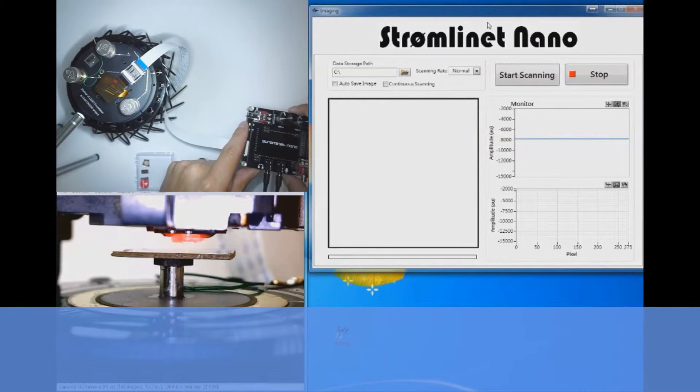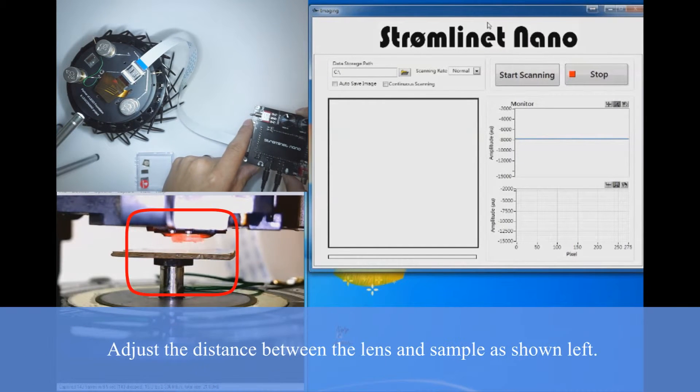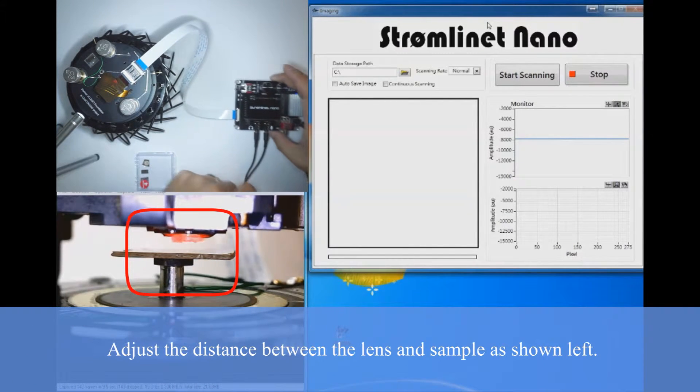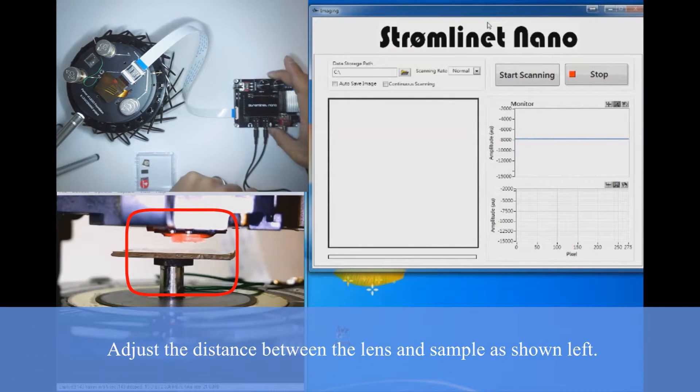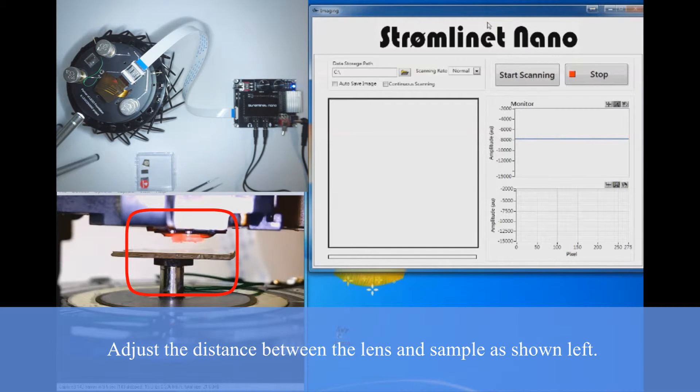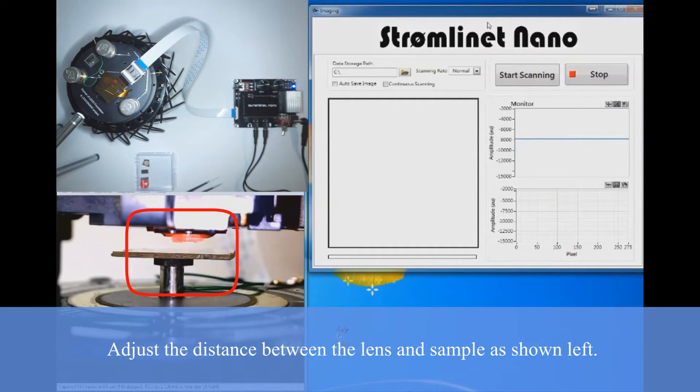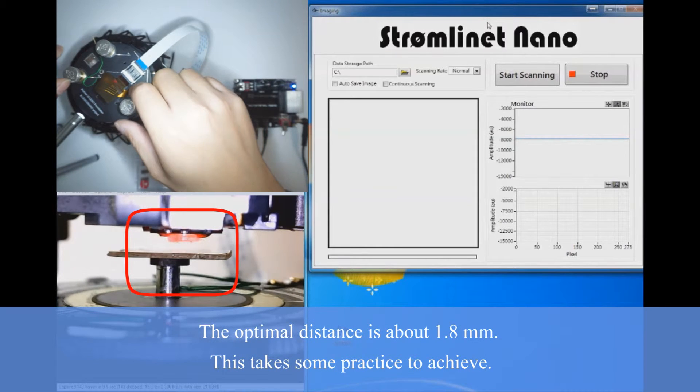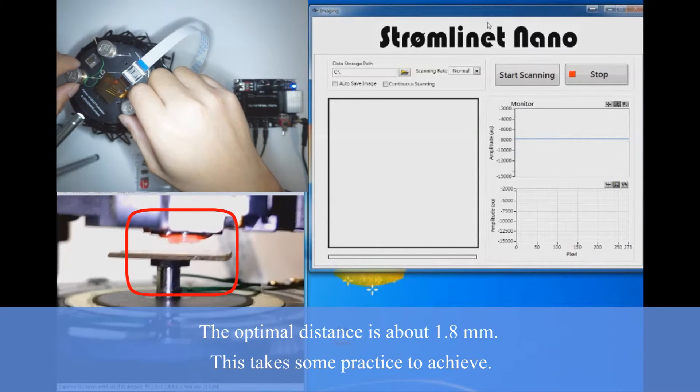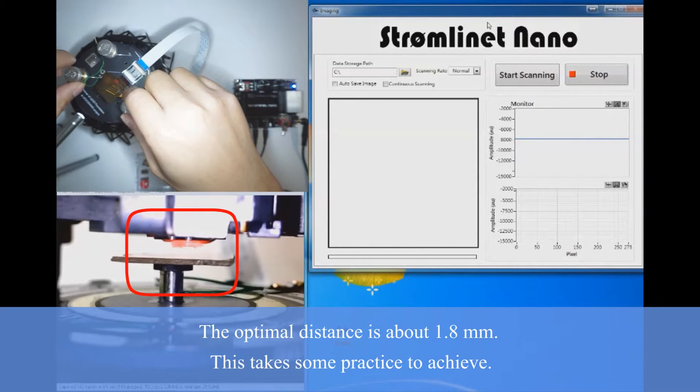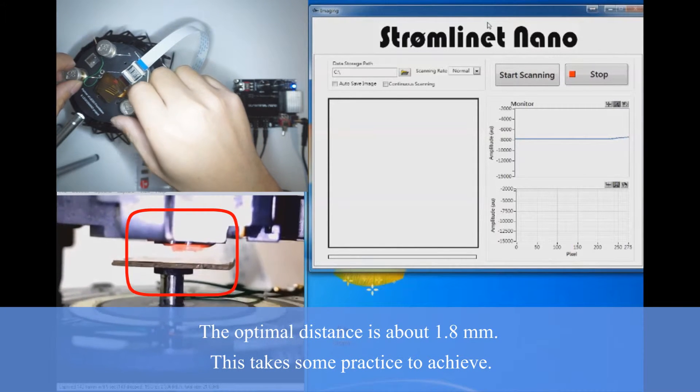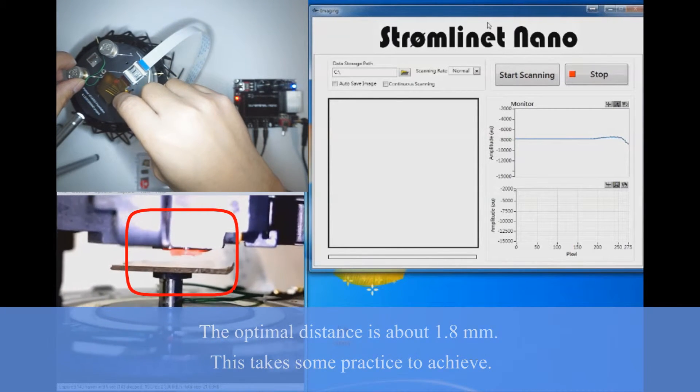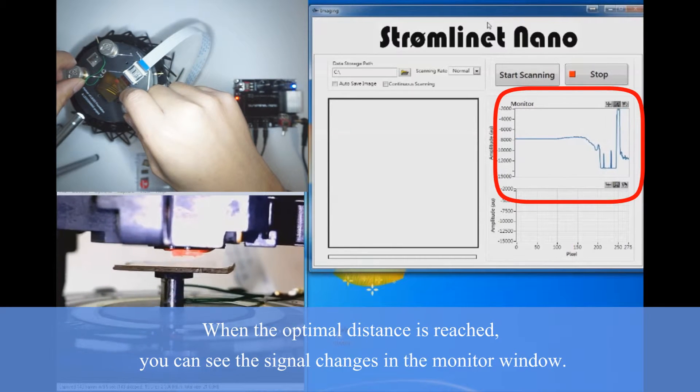Now let's adjust the distance between the lens and sample. Let's approach by turning counter-clockwise. The optimal focus distance is about 1.8 millimeters. It'll take some practice to achieve this distance.